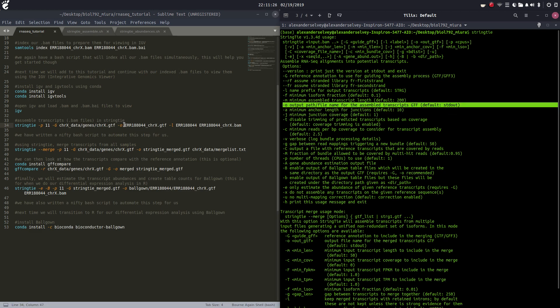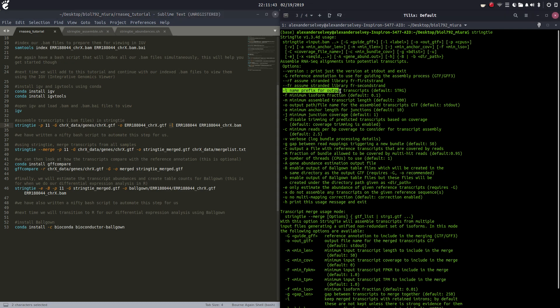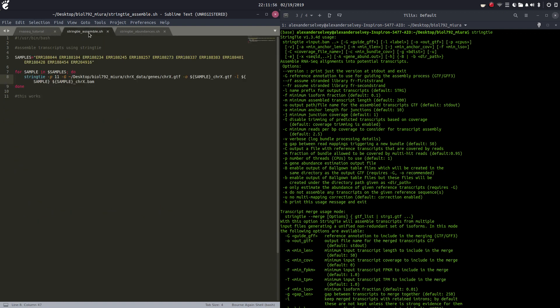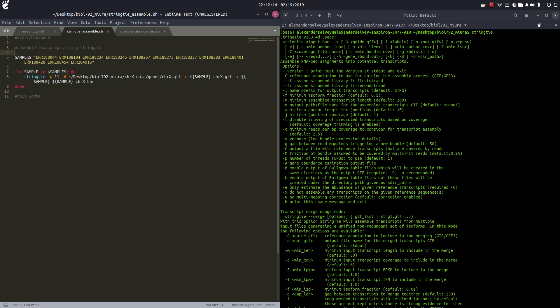Dash-o is our output path and file name for assembled transcripts. Here we have a single RNA-Seq read transcript experiment and we're going to output that to a GTF. Dash-l is the name or prefix for the output transcripts, and then this is our input file. If we come over here to my stringtie_assemble bash script, I've made a bash script that'll pretty much automate this for us. Essentially, if we run this bash script, it'll take all these samples and create our GTF files from them, assembling all those reads together into full-length transcripts.